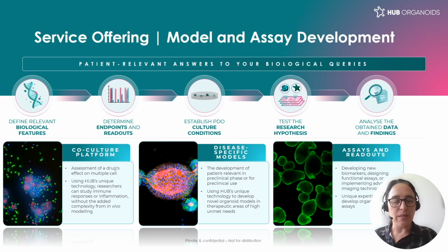We work on the assay development, either by fine-tuning the conditions where the organoids are expanded or the assay is performed, and then we start developing the assay and generating the data to prove that the assay or the biobank that we are generating fulfills the requirements or the criteria needed to get it adopted and accepted.